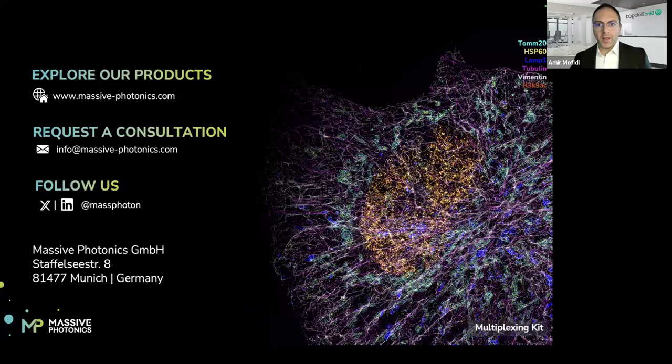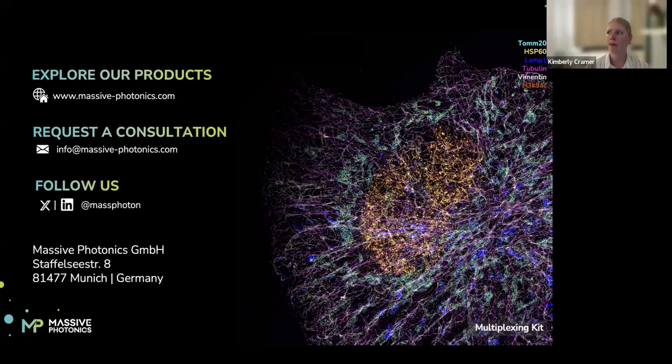Great, thank you. Yuchi asked, will the probe target RNA and genomic DNA and show non-specific binding? It really depends on how you design the probe. We now have RNA probes compatible with DNA paint imaging.